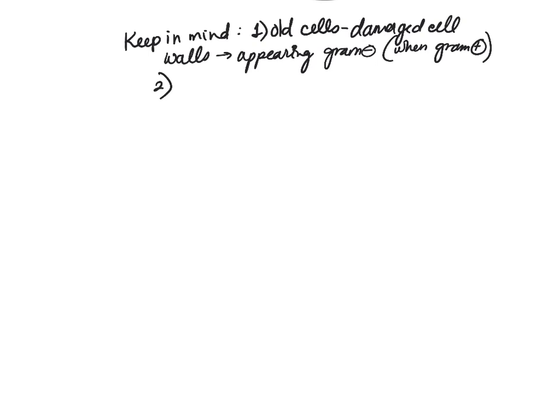Some of the organisms may appear gram negative, but they're actually gram positive.